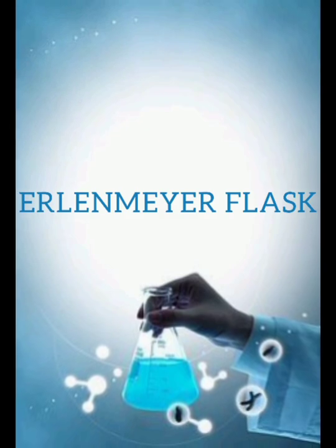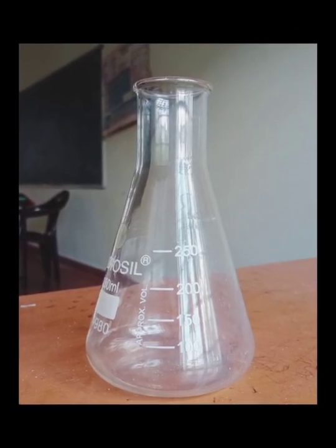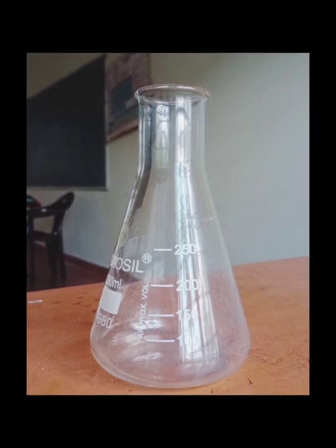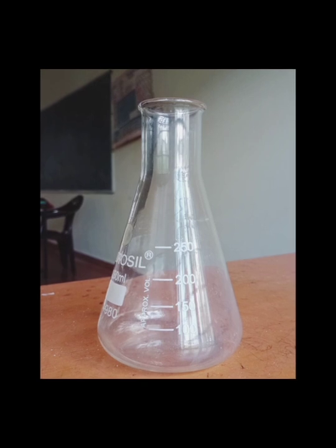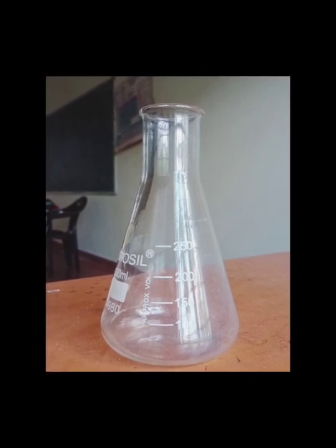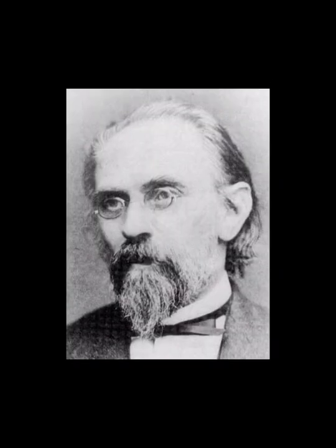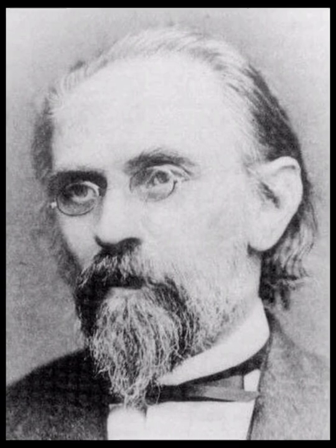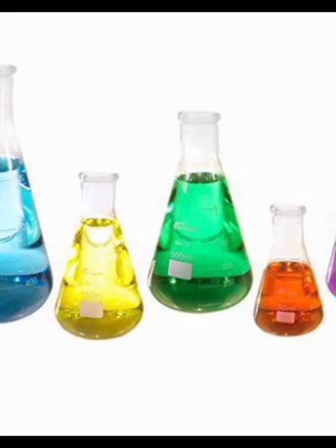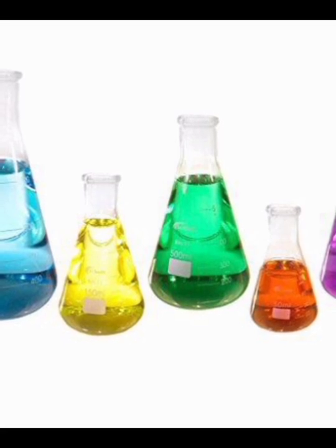Erlenmeyer flask. An Erlenmeyer flask is also known as a conical flask or titration flask. It is a type of laboratory flask which features a flat bottom, a conical body, and a cylindrical neck. It is named after the German chemist Emil Erlenmeyer, who created it in 1860. It is used in volumetric analysis for carrying out titration.